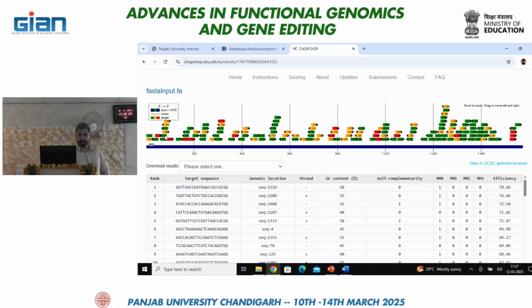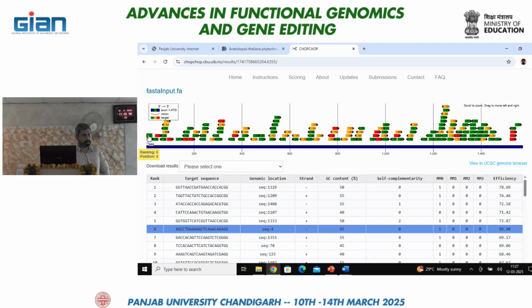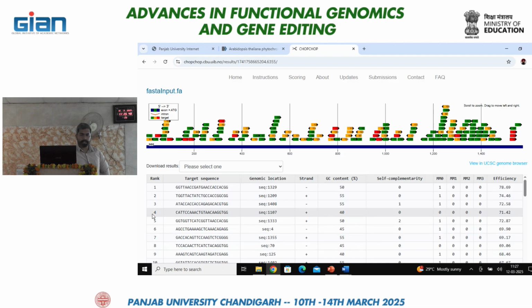In the graphical representation, this is based on their location. Below you can see the scale. The CDS I have taken is approximately 1500 base pairs, so that's why you can see this stretch here. This goes up to 1400 and further. So based on their location, they are there, not according to the list here. The list is according to their efficiency.